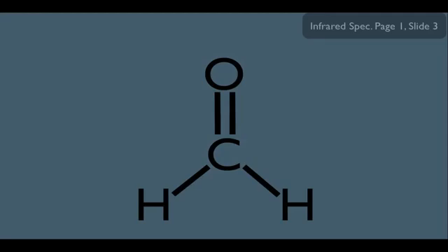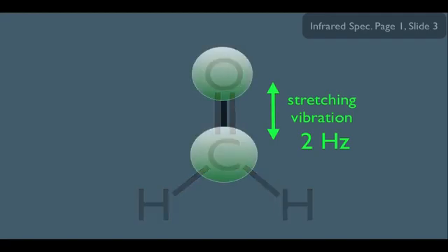What we've seen is that it can stretch, or have what's called a stretching vibration. And let's do this. Let's make up a number. Let's just say it happens to stretch at a frequency of 2 hertz. Now, what does that mean here? Remember, hertz is a measure of cycles per second. So if this is stretching at 2 hertz, it basically means this right here.